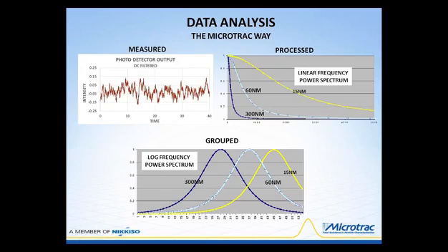That leads us to how this data is analyzed. We measure, with the system I've described, a noise-like signal that is the output of the photodetector.